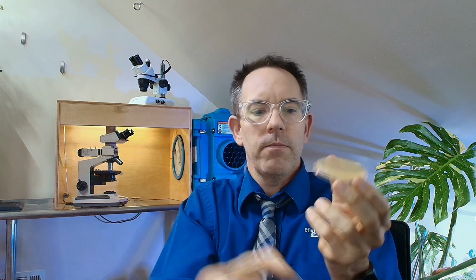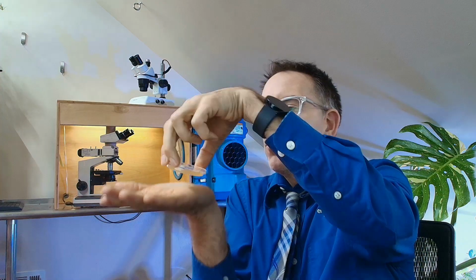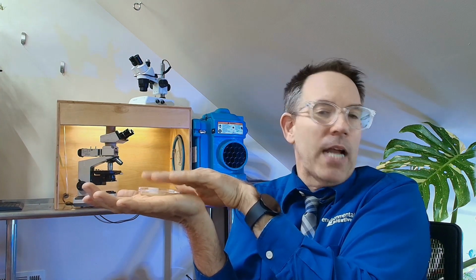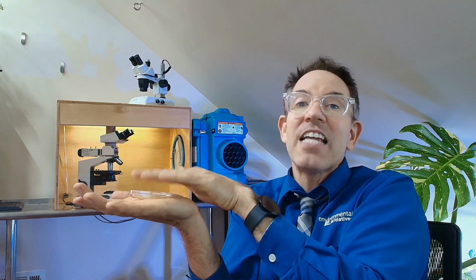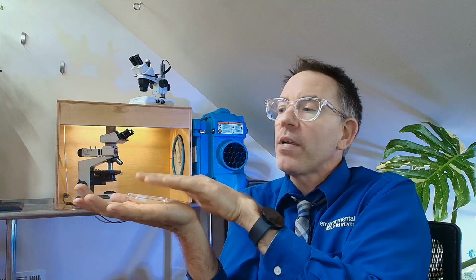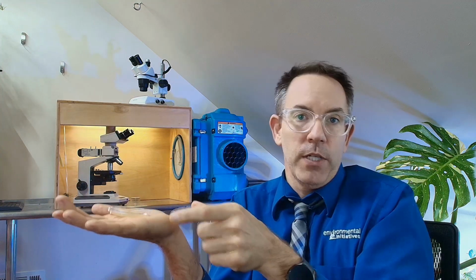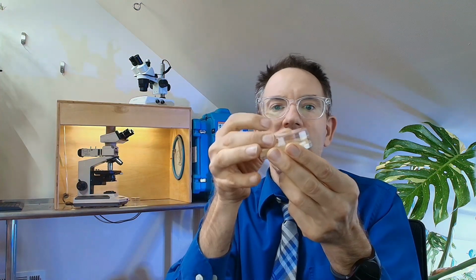Then you're going to sample a single surface. I'll show you: you take the cap off like this, and let's say I'm sampling my palm here. You push it down on the surface, tap, tap, tap, not too hard. Turn it 90 degrees, tap it again in the same spot. You want to know how many colonies there are per square inch, so you can't just go all over the place with it. So, the same spot. And you put the top back on.